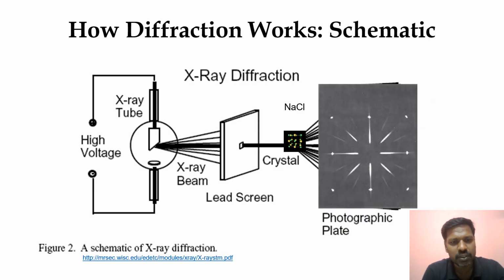The diagram shows how X-rays reflect from crystal planes. The key idea is that at certain angles, reflected X-rays add together, and at other angles they cancel out. Only the angles satisfying Bragg's law produce diffraction peaks.